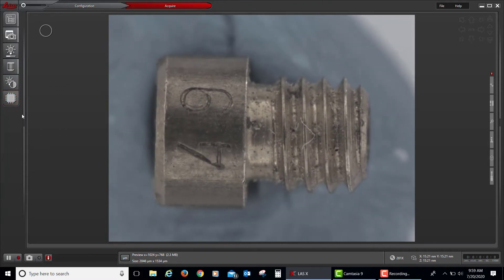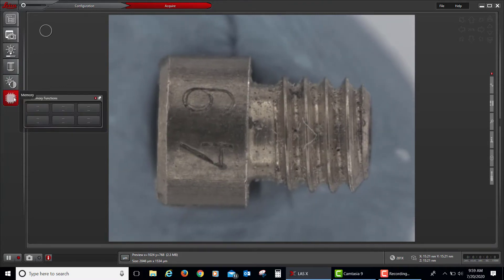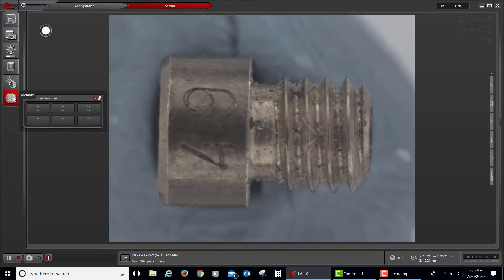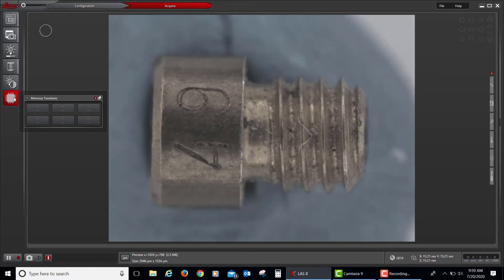And then finally, below that are different user-defined memory functions that can be memorized automatically for quick access.